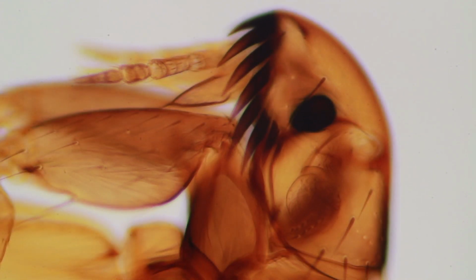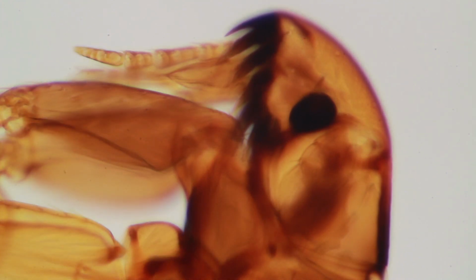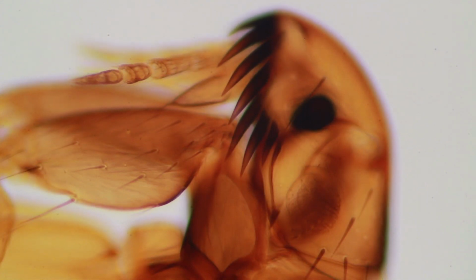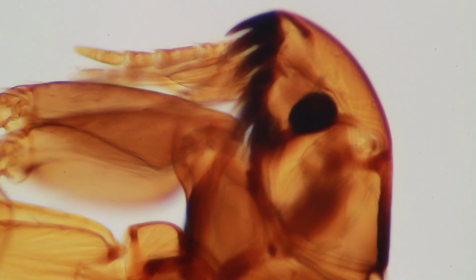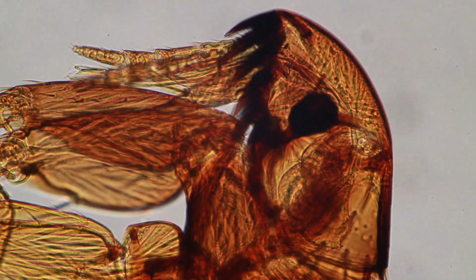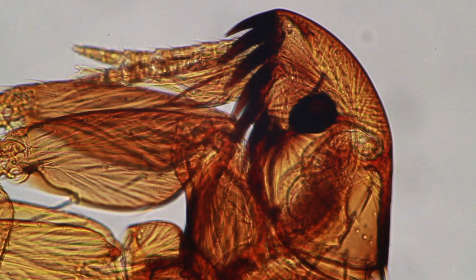Now here I have the condenser opened, and you can see that this little dog flea, basically the front and the back parts are not in focus. So I'm focusing back and forth, and it is very difficult, or not possible, to get all parts in focus. The image also looks a little bit blurry. However, when I close the iris diaphragm of the condenser, the image will appear sharper.